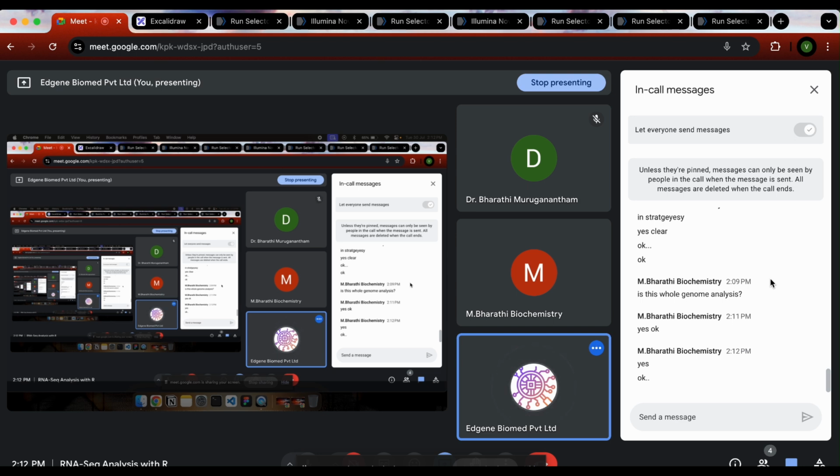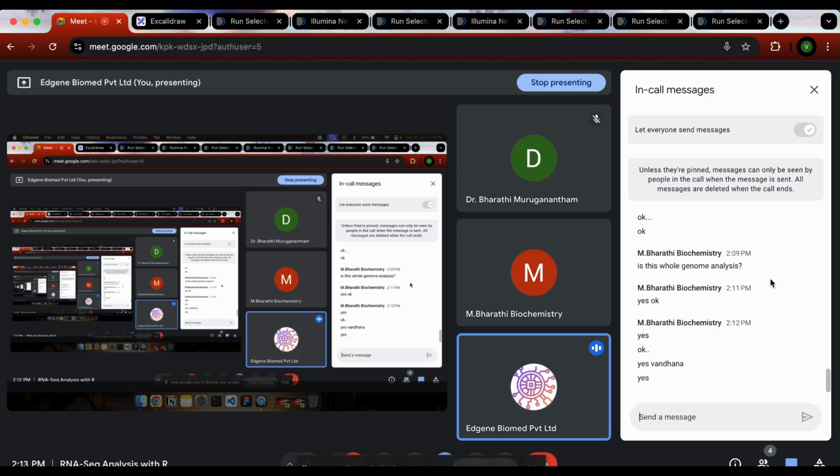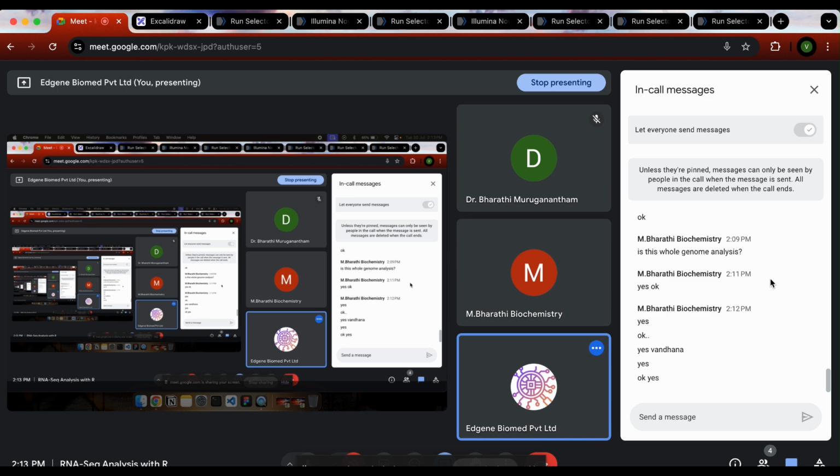Pretty much clear with the idea of how to search for data? Now what I want is that you might be looking for some other data, right? You might have a lot of different ideas. So I want you to search your own data. Can you do that? Yes. So you're clear with all the steps, how to do it? Any issue with the steps?